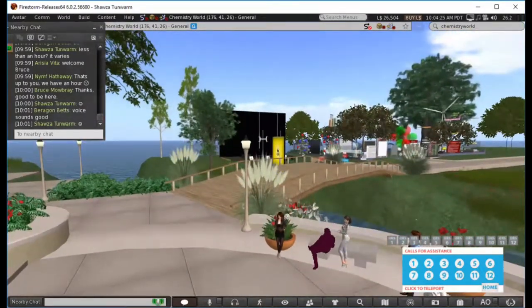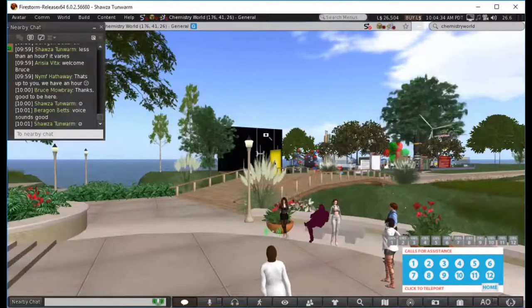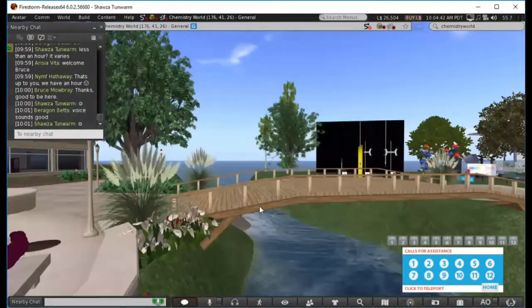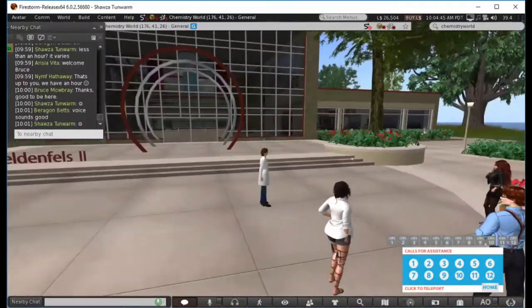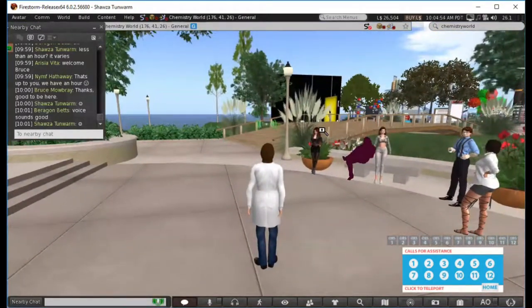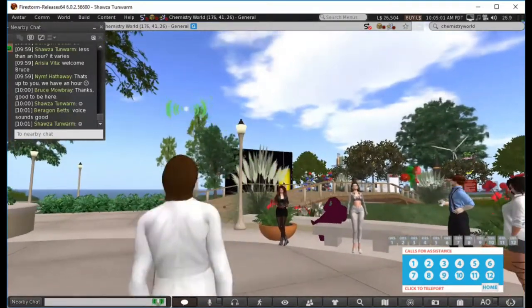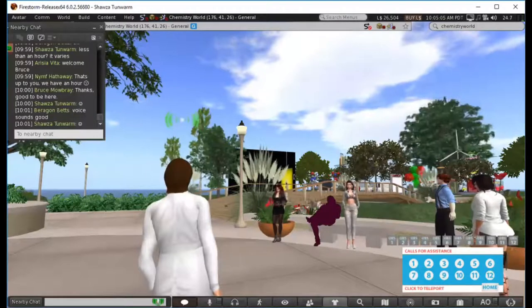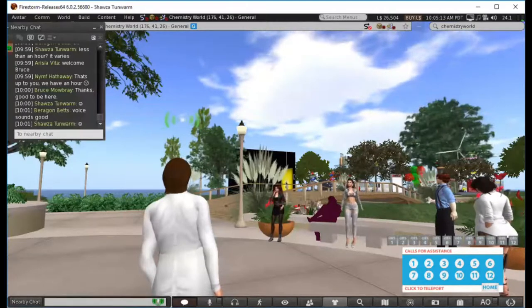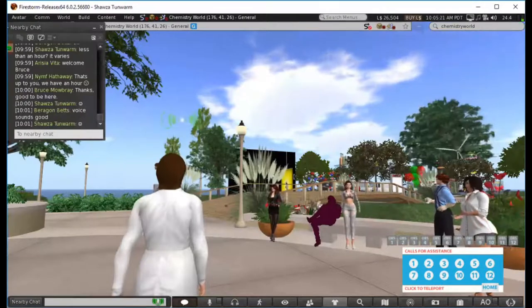When the students first came into Second Life, they had to be trained to do a couple of things, like change their perspective of what they're seeing by adjusting their camera. They also had to pick up a pair of goggles, and there were other specific skills they were going to need during the experiments. So we had a training area set up just across the bridge. The training was mandatory, because otherwise we found they would just muddle around and get frustrated and take a lot of time that they should have spent doing their lab experiments.